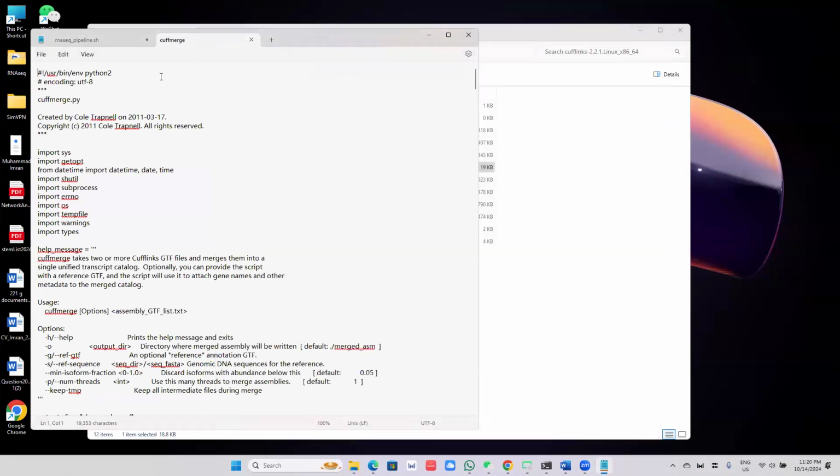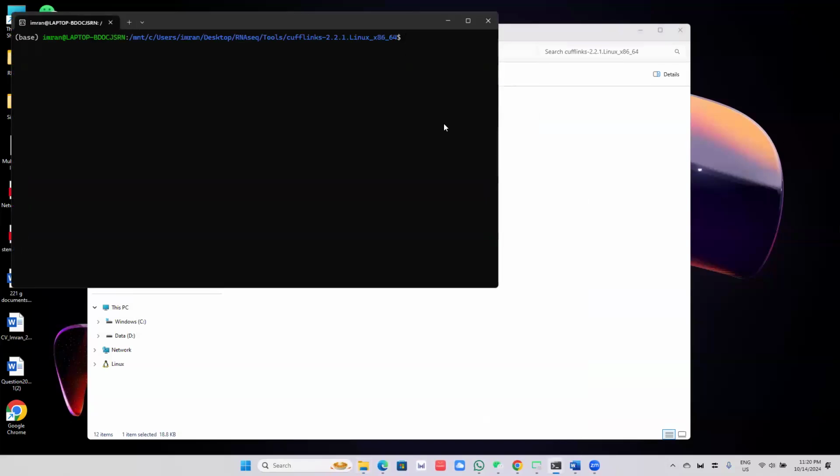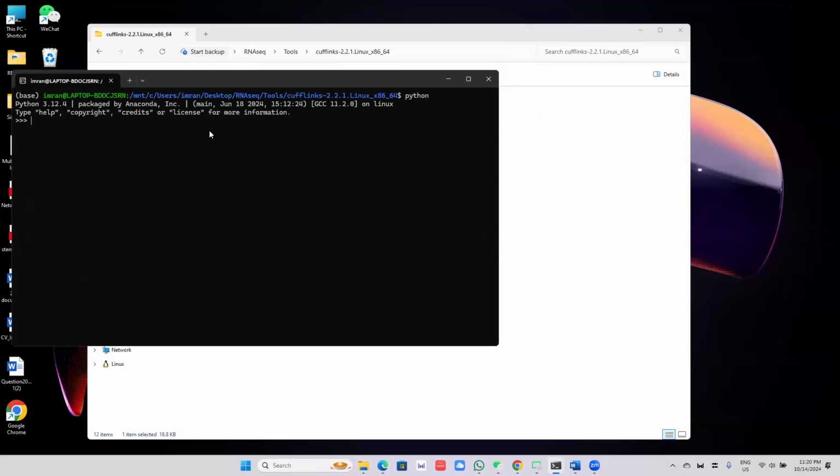Just open the terminal now. I can see you have written Python 2. Cancel this. Now open the terminal. Just write Python here and press Enter. Control Z. Have you installed the Python 3 version, Imran? Yes, ma'am.